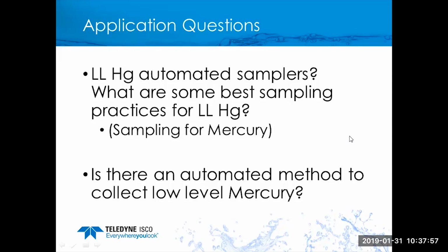The best things you can do is be very logical and determined at where you place your intake line. If you happen to see that there's a location in that channel where there is more of a preponderance of debris, avoid placing the strainer into that location.